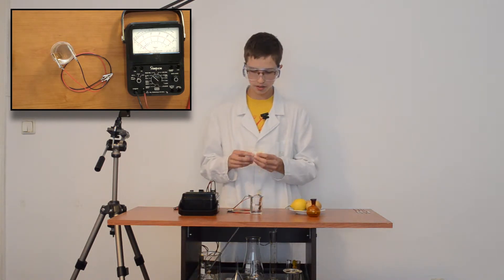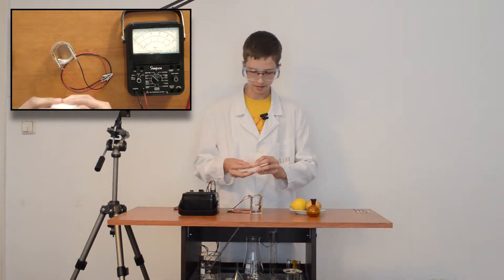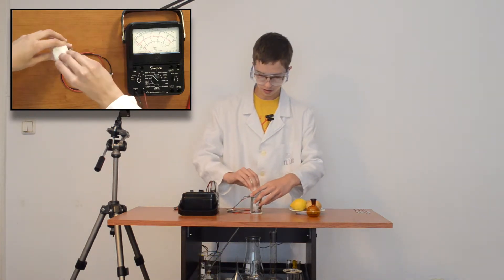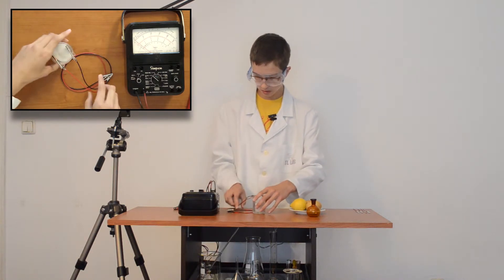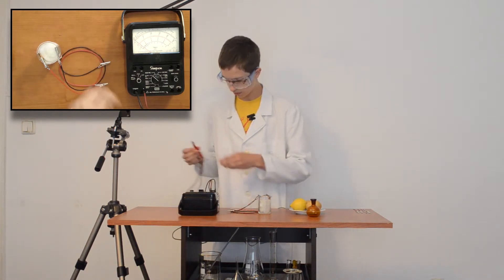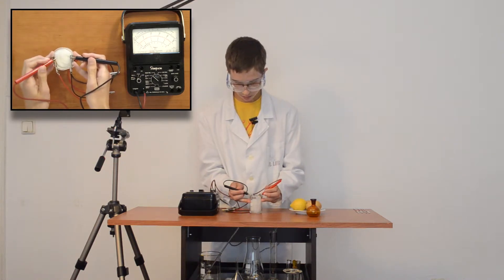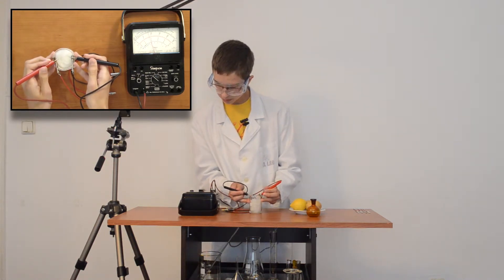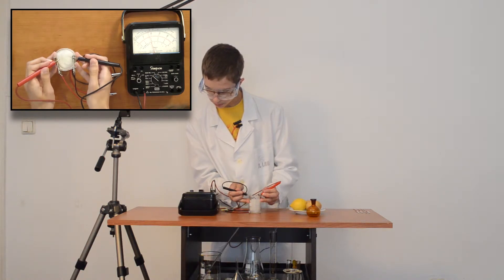I'll put this in the beaker to hold the electrodes in place. Now to measure the voltage — here the voltage is about 0.9 volts.